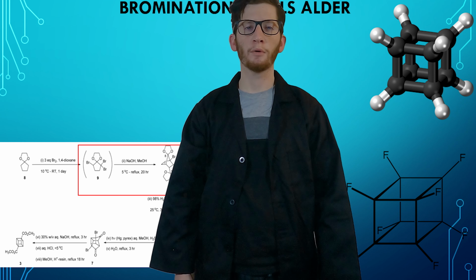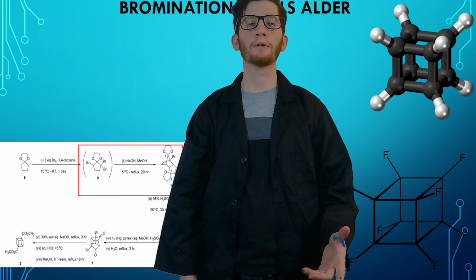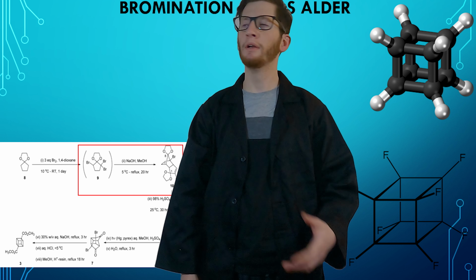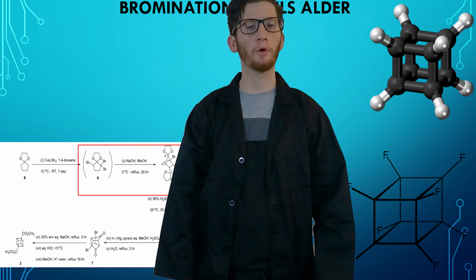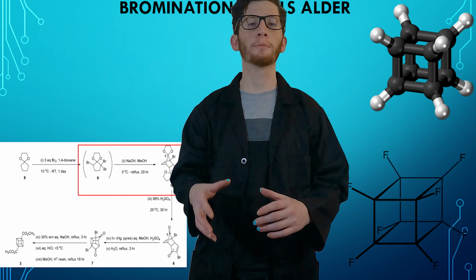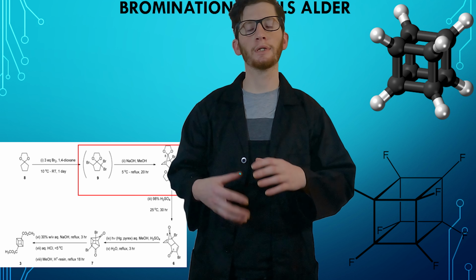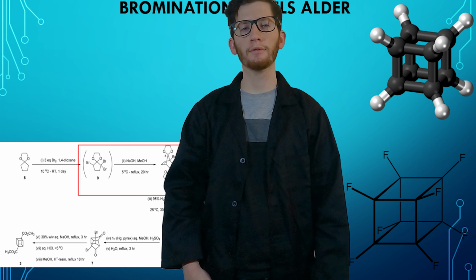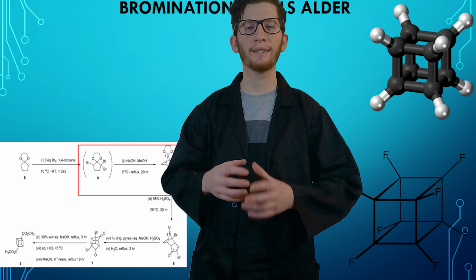All right, so we've made it quite a long way here. We've gotten past the hurdle of the vacuum distillation, which I was a little bit worried about. It was rocky, but we got it done. Now moving forward, we're going to have to brominate our product and then perform a Diels-Alder reaction to sort of warp that molecule into something that we're actually going to start to form in the cube, really. We're going to form the cage.